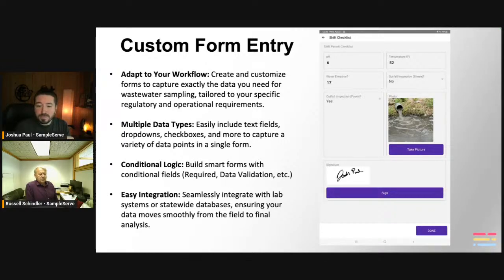Yeah, so the term is geofencing. This is adjustable by the project manager: if you're more than 5 meters away from a sample location, it's going to ask you why you're so far away. But that's adjustable. When we do tests for sampling in faraway states, and I'll be sitting here, it'll literally pop up and say you're 1,923 meters away from the sample location. So it literally measures how far you are away. If you're within the allowable zone, within 5 meters, it's not going to pop up, because now it knows you're at the right location.